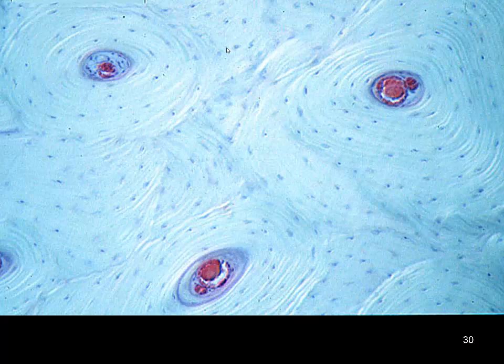Now we're looking at the osteons that we have present here. And so we can see 3 Haversian canals that are present in the center of these osteons. And as we find the outermost stretches of these, that's where we can find the cementing line, which is going to be in this location for this particular osteon. Here we can see a cementing line for this osteon.